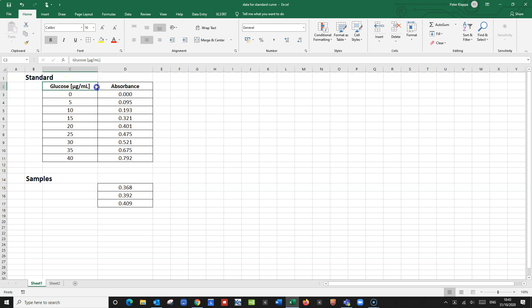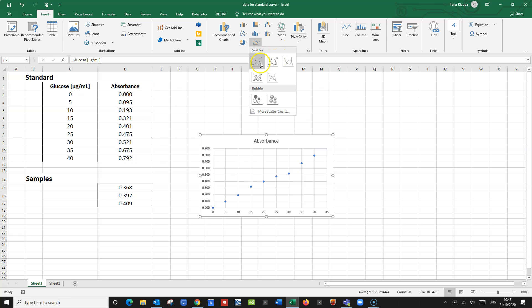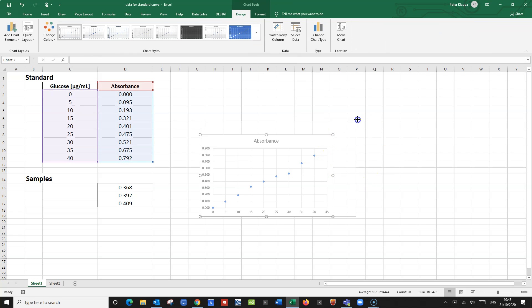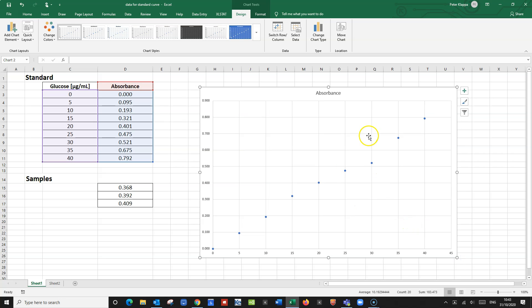First, we highlight all the cells for our standard curve with the left mouse button pressed. Then we go to Insert in the ribbon, and we go to Charts where we see all these options. We go to Insert Scatter Chart — not bubble charts, we go for scatter — and we choose this scatter plot. And we get a nice scatter plot, but we would need to do a little bit of axis manipulation.